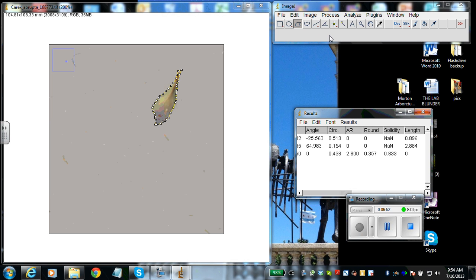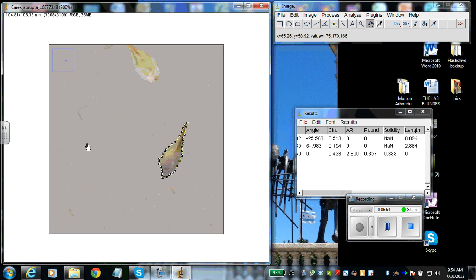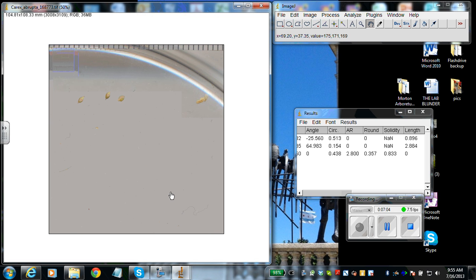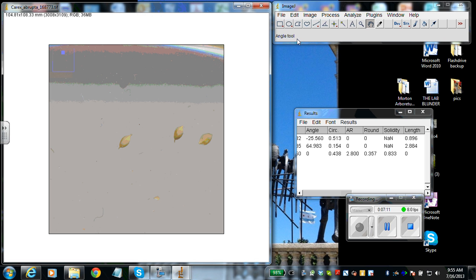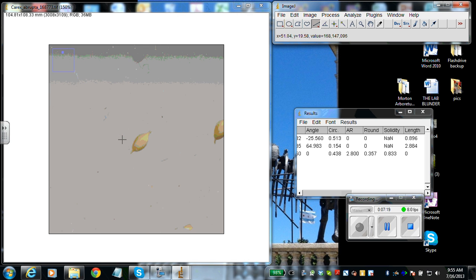I'm going to move up to the achenes now and show you the achene measurement. Find it. If I can't find it, I'll zoom back out, which I'm going to do. There's my achenes. So I'm going to pick one of the achenes and obviously follow the protocol, because the protocol does tell you how many perigynia and how many achenes you need to make measurements on. This one, we're just going to do widths and lengths. So I'm going to zoom in one more time. I'm going to do a width here. Straight across. Try to keep that line nice and straight.